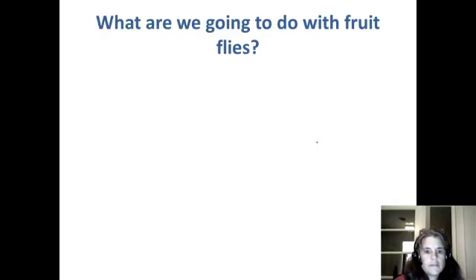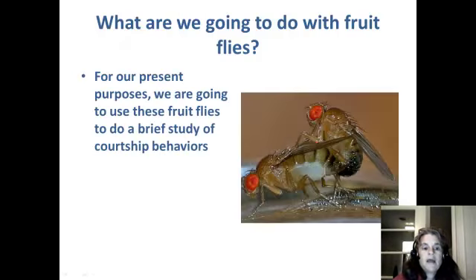Okay, so what we are going to do with fruit flies, okay? For our purposes presently, and I'm sure nobody wanted to see that picture, but we are going to be using fruit flies to study courtship behaviors as part of our animal behavior unit. You should have read some information about courtship behaviors and so on, and there's some really ritualized behaviors that flies go through as they're mating. So hopefully we will be able to observe at least some of those. So we'll use them for that initially.